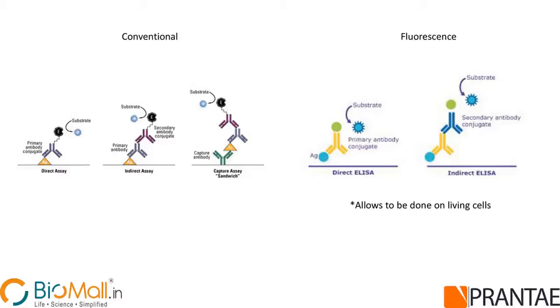Now, almost 80% of all molecular diagnostics which is done is by looking at the level or the presence of a particular protein that we are interested to look at. The hypothesis being that if my protein is present, yes, I may have the disease, or if my protein is absent, then I may have a disease, depending on the case specific. For example, a cell becomes a cancerous cell only when there are certain proteins expressed on its surface. Then you know that this is a cancerous cell and not a normal cell.